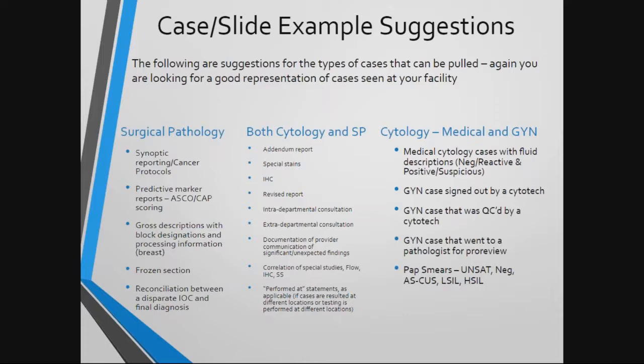Cases where there was documentation of provider communication of significant or unexpected findings are always good to have on hand. Also have correlation of those special studies, so your flow, FISH, IHC, special stains, etc. And then examples of the performed-at statements, cases with that. So that applies to all of the cases at my facility.